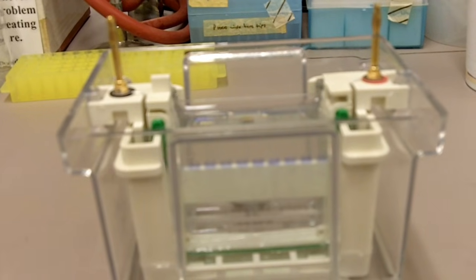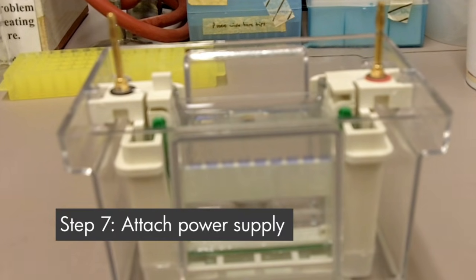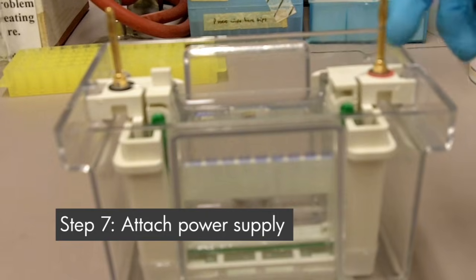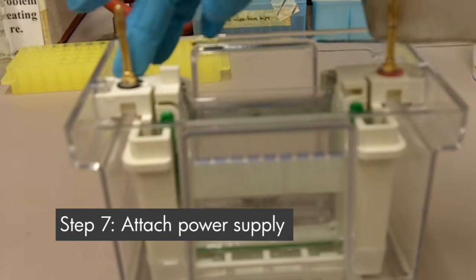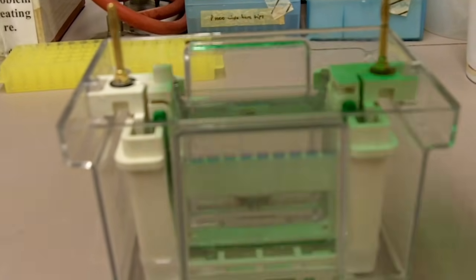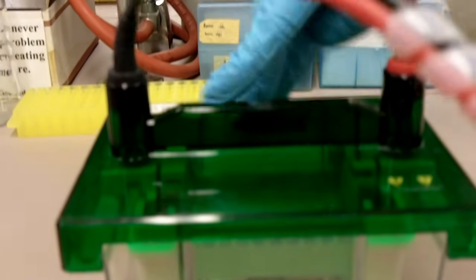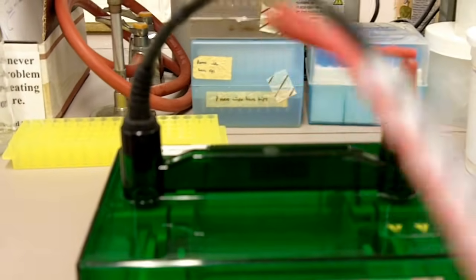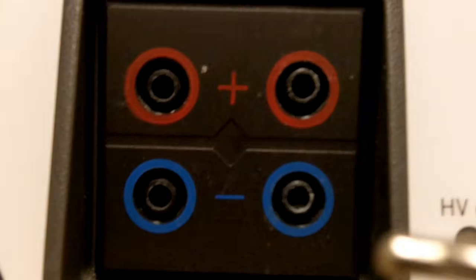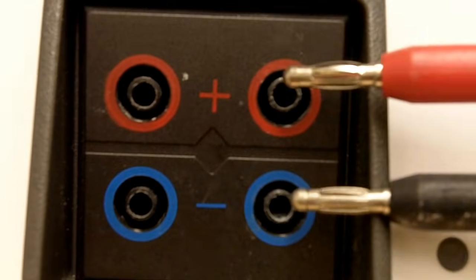After you pour in the buffer, it's time to hook up the tank to the power supply. As you can see right here, it has a red electrode and a black electrode. So you put on the lid like that, black to black, red to red. And then you hook up the power supply the same way. Red to red, black to black.